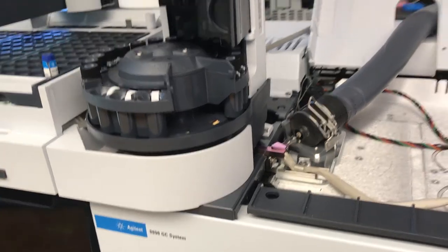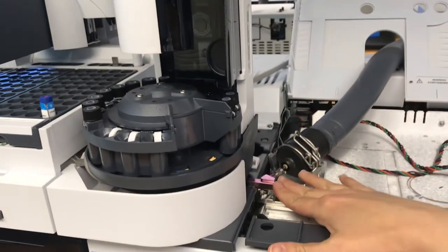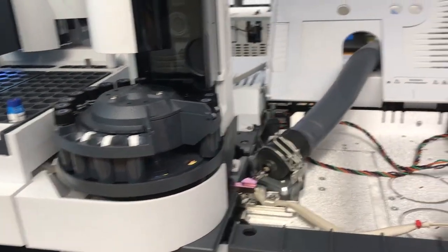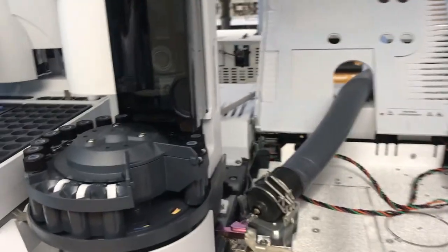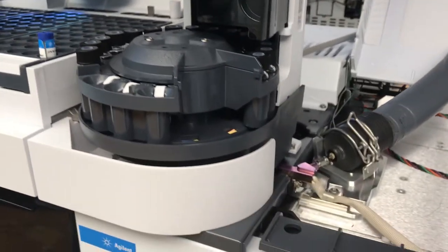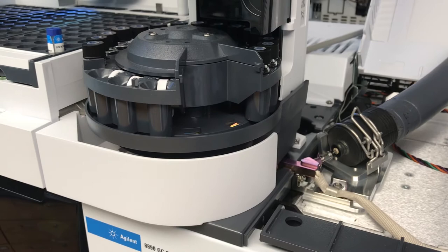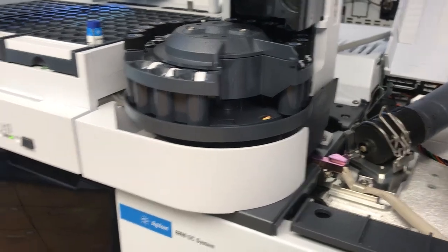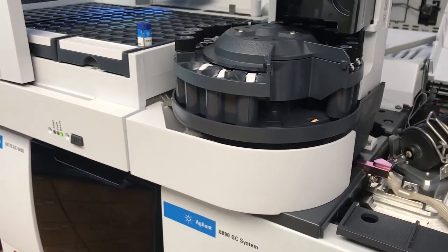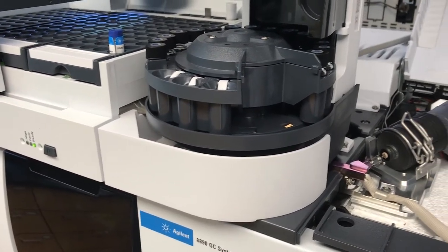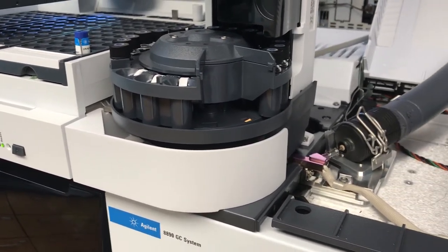So we have a special device here that keeps the headspace and the autosampler connected at the same time, which is a very nice feature.